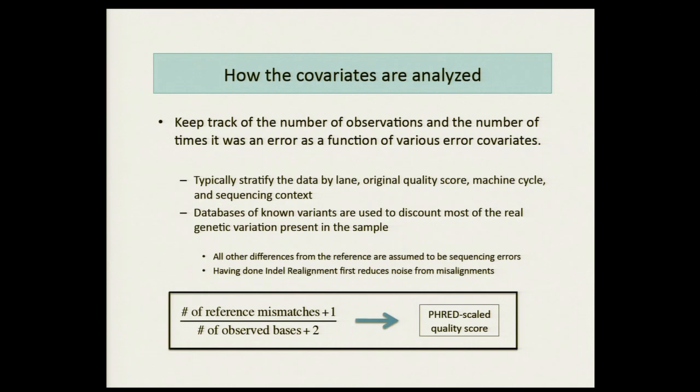Do this on whole exome, or is it limited? An exome is perfectly fine, yeah. So I think our baseline is you need something like 15 million observations, so 15 million sequenced bases, which you have way more than that in an exome, so that's fine. If you're doing a very small target region and you only have, for example, 100,000 bases sequenced, it's probably not a good idea to use this procedure, right? Because you just can't accurately estimate those quality scores, right? But anything on the whole genome or whole exome scale, perfectly wonderful.